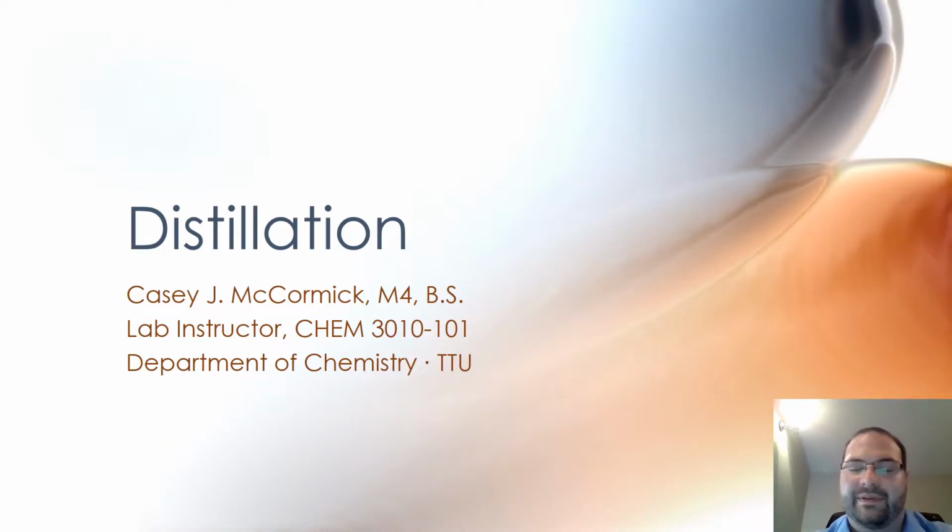Hello, this will be your pre-lab webinar on distillation, which is the process we'll be learning Monday and is one of the most important lectures we'll have the entire term on any organic chemistry techniques that we'll be learning. And as I had mentioned earlier in the course, this first semester in the laboratory at least is primarily focused on you learning the different kinds of techniques that you use for separating items in organic chemistry, and also some work towards understanding some of the reactions. But they're pretty basic at this point, and they won't be very complex yet.